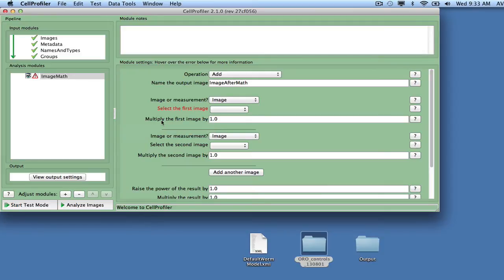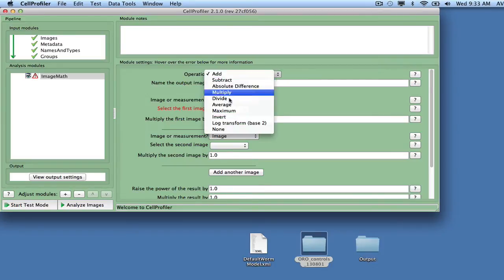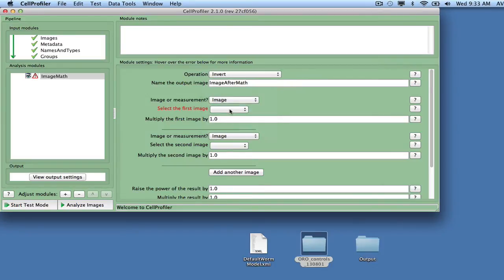For this module, select Invert as the operation, call the output image Inverted Raw, and select Raw Data as the input.